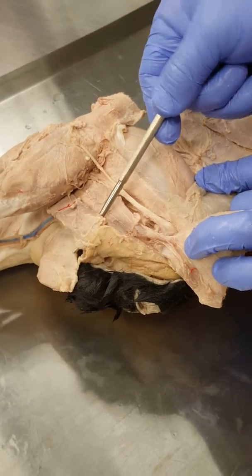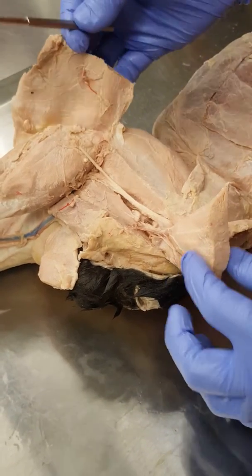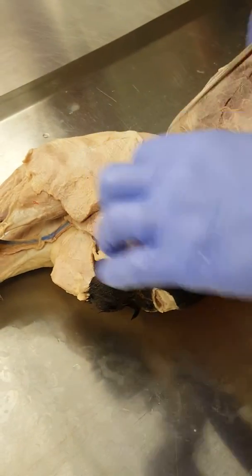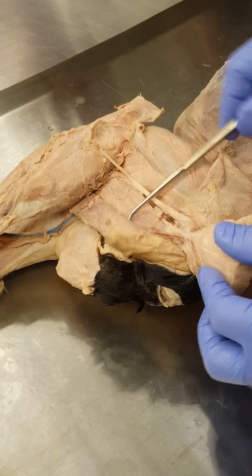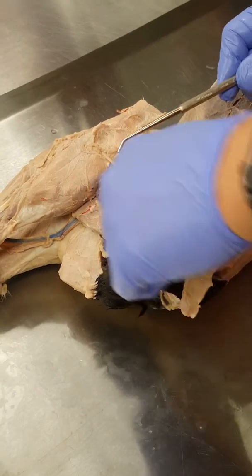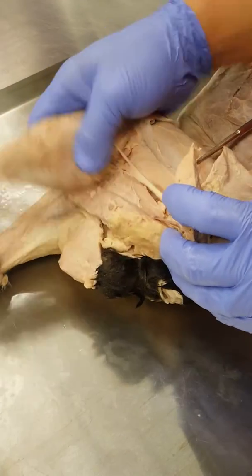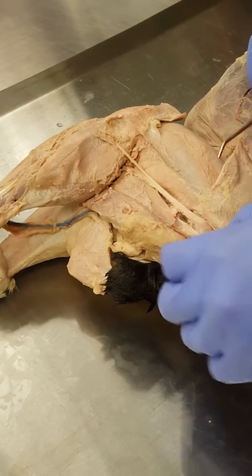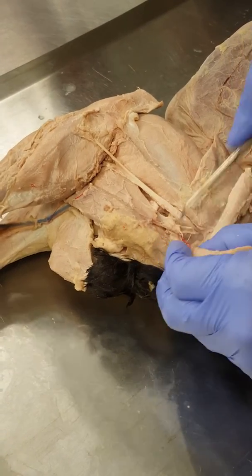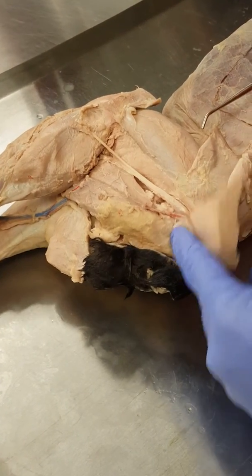So same order. And then what we have opened up here, this is the biceps femoris. So those three muscles, biceps femoris, semitendinosus, semimembranosus, they make your hamstrings. Those are the ones that flex at the knee, like this. And you can tell that they're all together right here, because if you follow every single one of them all the way back, they all originate from the same spot, right there.